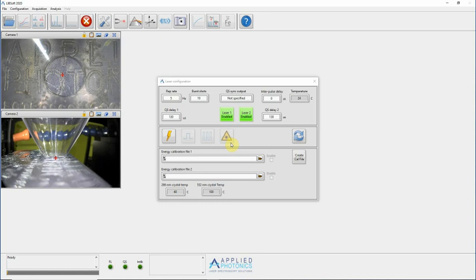It should be noted that the Lightron Bernoulli laser can be configured to operate either at 266 nanometers or 1064 nanometers. The configuration required to set the operating wavelength is done in hardware and can then be optimized using Lightron's own software outside of the LIBSoft application. The only software configuration changes are made during the initialization of LIBSoft, and as long as the correct operating wavelength for the laser is selected in the LIBSoft system configuration window, no further changes are required. This laser configuration window is the same irrespective of the operating wavelength of the laser.